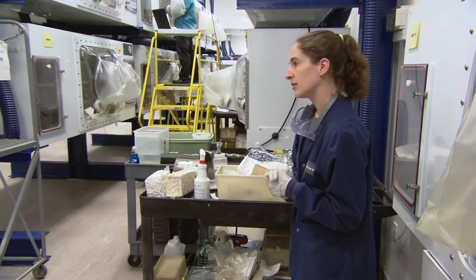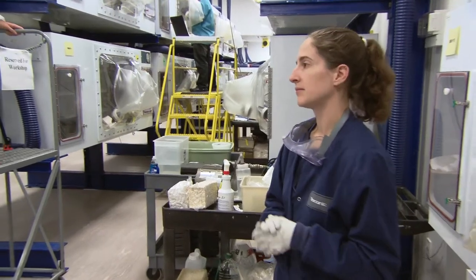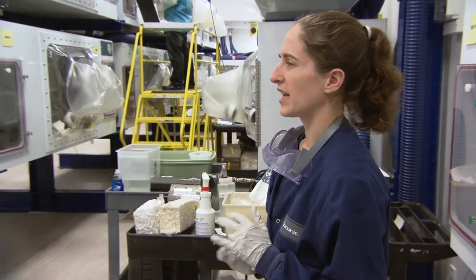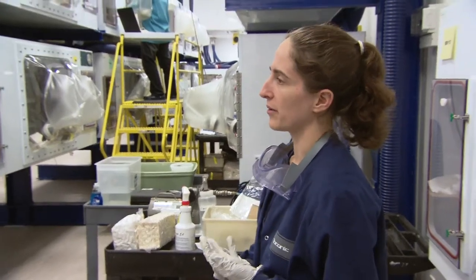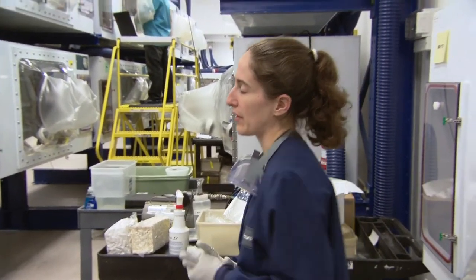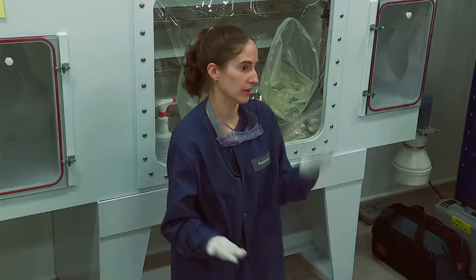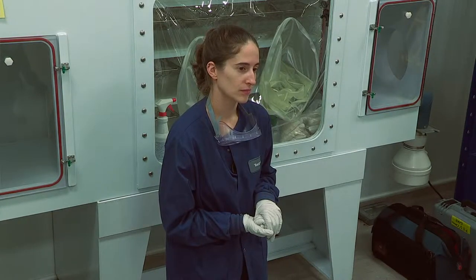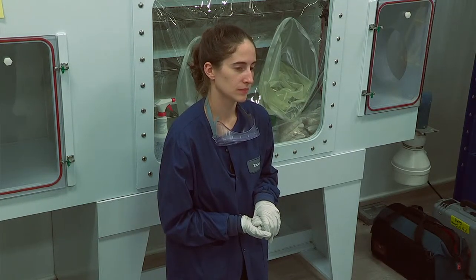What kind of time should you allow for the sterilant? Make sure the sterilant doesn't get on the swab — so do you let it dry sufficiently before you do your swabbing? I believe in the setup it's four hours minimum dry time, Frank? Yes. At least four hours, usually overnight. You want the inside to be completely dry so there's no wet sterilant left inside. It may make a difference depending on how much you spray, what particular product you're using, or if you're using the atomizer — definitely overnight is probably the best.